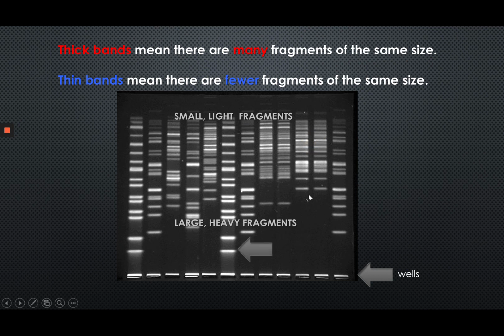But if we look at a band, this one at the bottom here, you can see that this band is quite thick, and the one above it is actually even a little bit thicker. And then you see some bands, like over here, where it's a very, very thin band in comparison. Well, the thick and thin bands just tell you the amount.